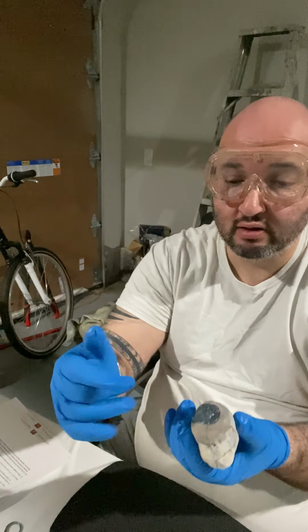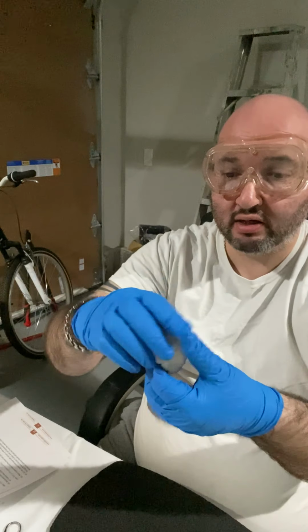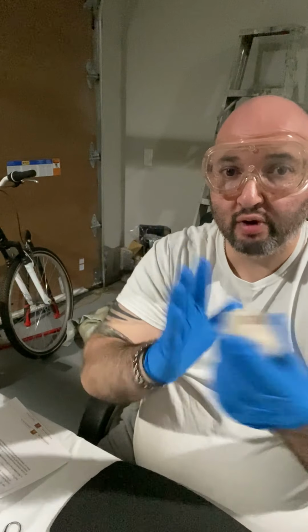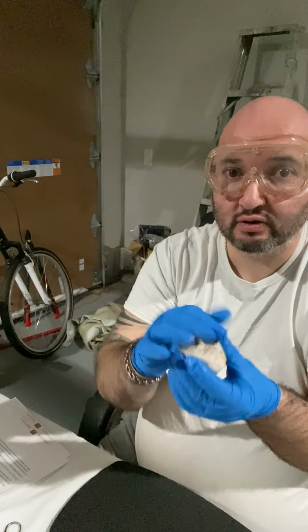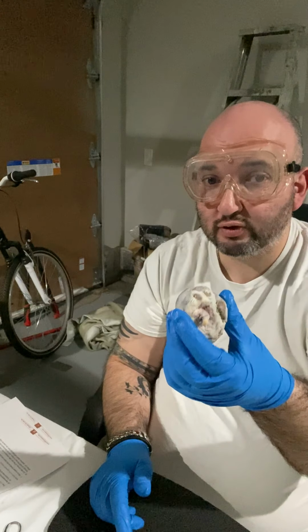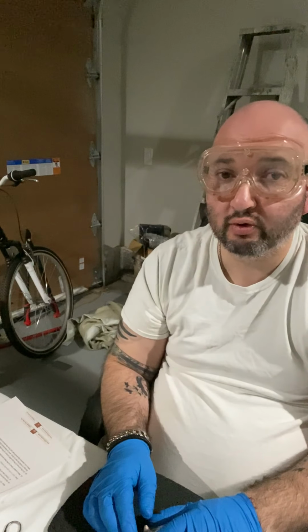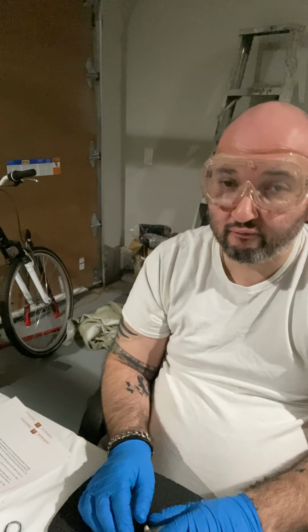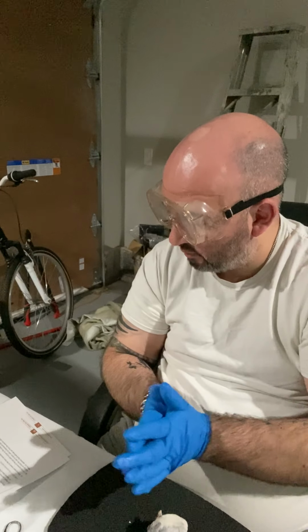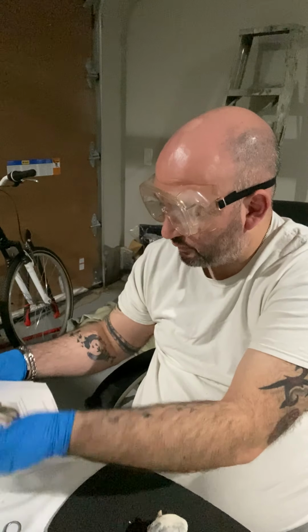Okay, so technically, this is the front of the eye, so information goes here, there's a retina back here, and it goes through the optic nerve, and then of course out to the brain where things are processed and then vision generates from there. All right, so from this portion of the eye, I'm going to go ahead and cut what's called the cornea, which is the transparent layer forming the front of the eye. I'm going to cut it so that we can view further structures of the eyeball.